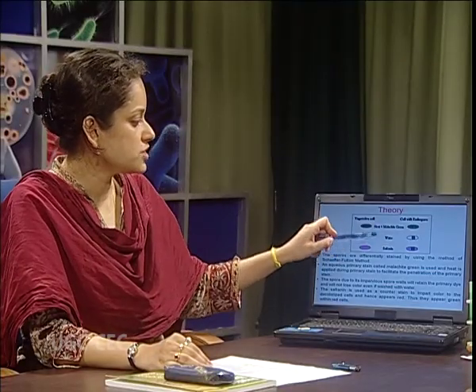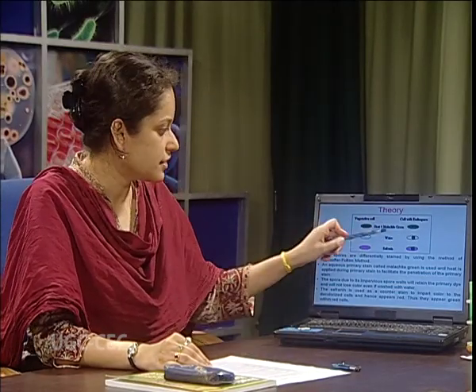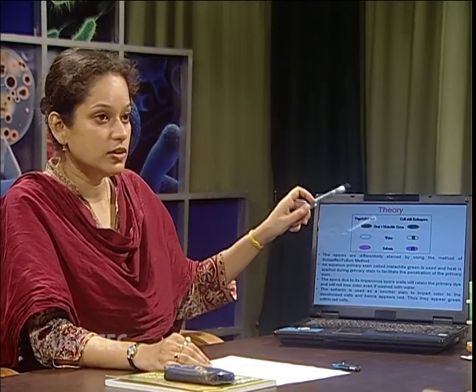Now, when we are using water as a decolorizer, then only the endospores will retain the primary stain, while the rest of the vegetative cells will lose the malachite green. And why is water used as a decolorizing agent in endospore staining, not acid or acid alcohol? Well, malachite green is made soluble in water. So when you use a stain which is soluble in water, you have to choose the decolorizer as water only, because the primary stain is soluble in water.